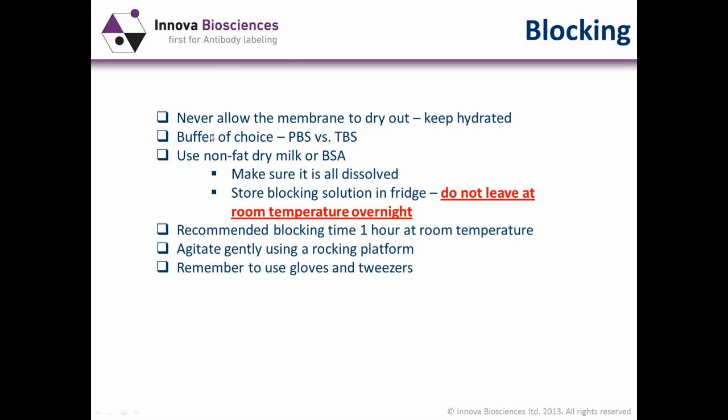Now comes the buffer of choice. People commonly use PBS versus TBS. I found that I had more success with Tris-buffered saline than PBS. Again, this could have just been a preference.